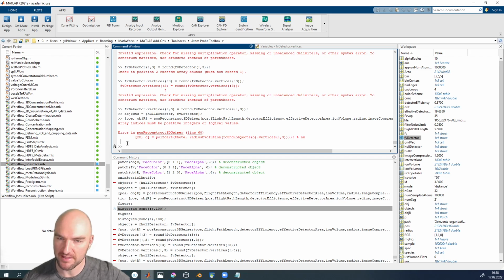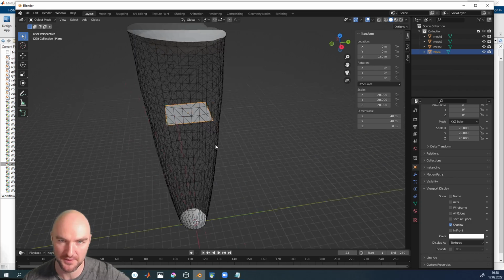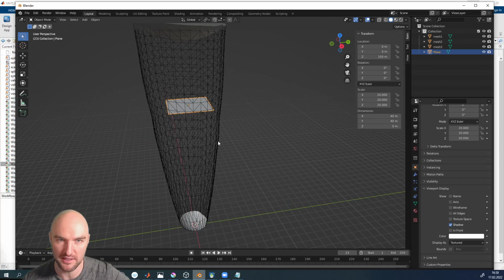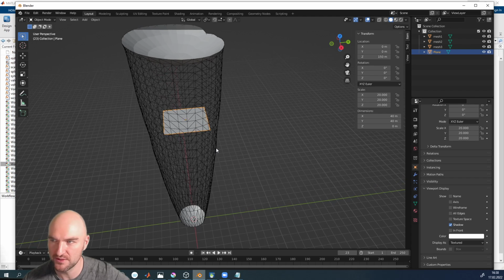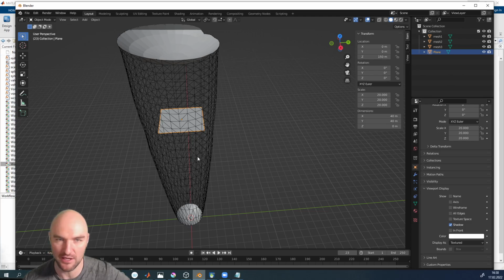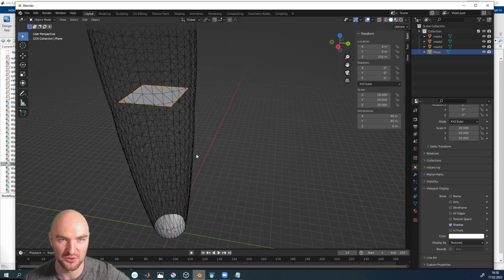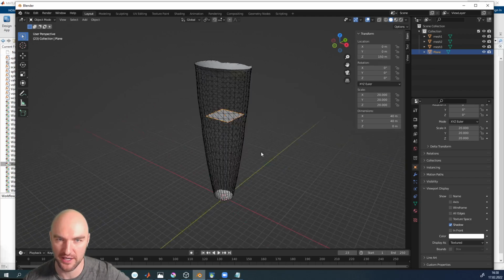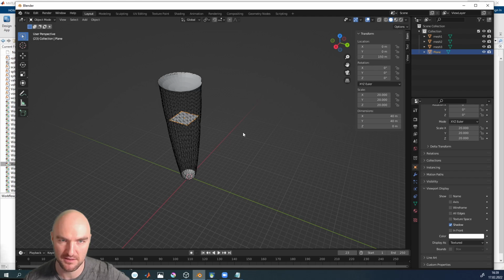Okay, so this was a bit of an introduction of how to do reconstruction with objects. Sorry, at the end it didn't quite work out as tested. It's always a bit harder when you're not as fast with moving stuff around an unfamiliar computer. But you've seen with simple things like a plane that's not a big deal. You can do an inverse reconstruction very easily. All you need is to have the coordinates in detector space and in reconstruction space. So you need to have your EPOS file essentially, and then you can translate any object that you have created that doesn't do funky things like moving outside your data domain. You can reconstruct it back into the detector domain and then co-reconstruct it and then use that to drive your reconstruction. So today we were actually using some very, very simple objects, mainly the plane.